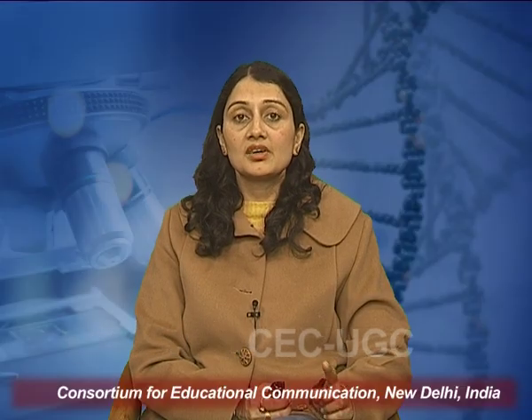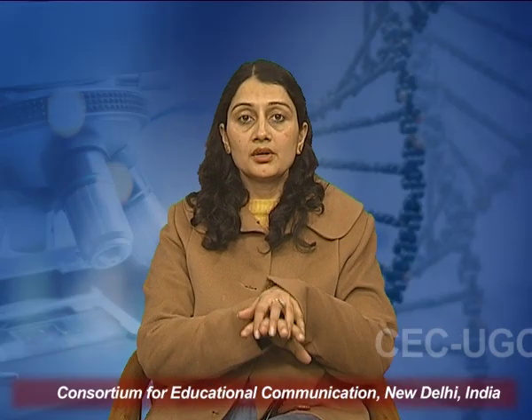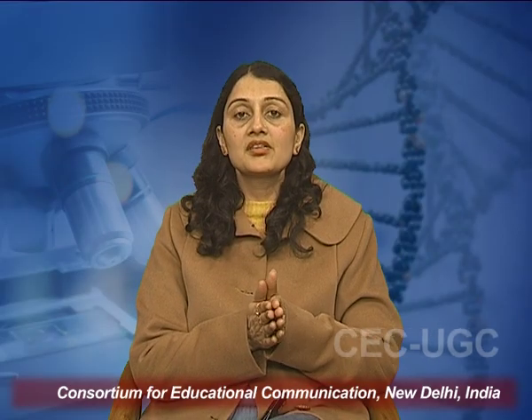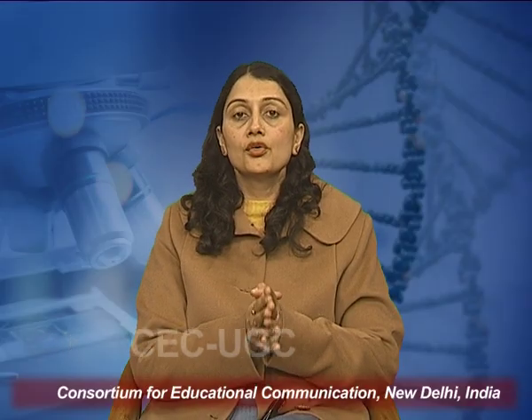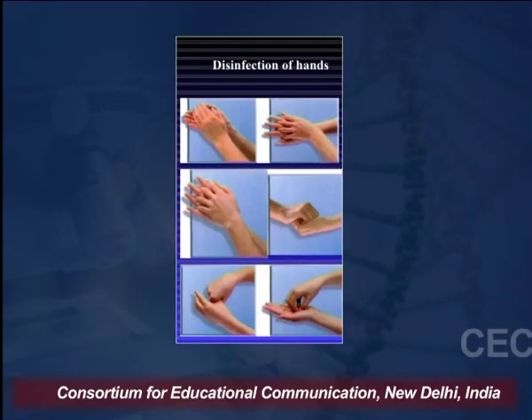So, first thing you sterilize is your hands. There is a proper way to disinfect your hands before you start any microbiological experiment. First you rub the top portion, then you rub in between, and then you rub in between the thumb and your index finger, and all this is done with 70% ethanol or alcohol. That is the basic disinfectant that you use for your hands, so that your hands are clean and devoid of all microbial growth.